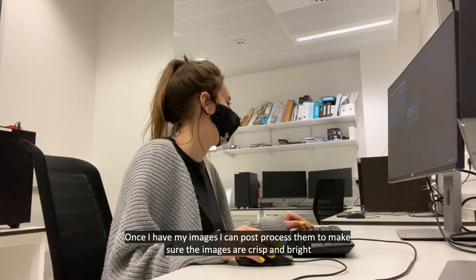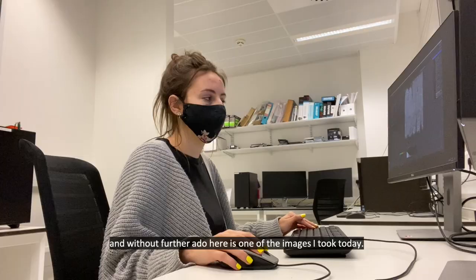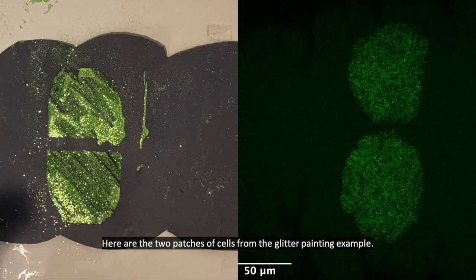Once I have my images I can post process them to make sure the images are crisp and bright, and without further ado here is one of the images I took today. Here are the two patches of cells from the glitter painting example.